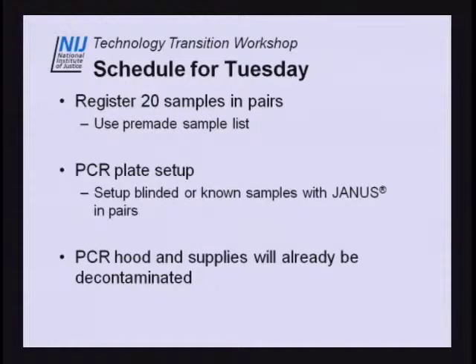So we'll register the samples here, and then we'll do the PCR setup with the Janus. And like I said, we'll already have the hoods and supplies ready for you to go.